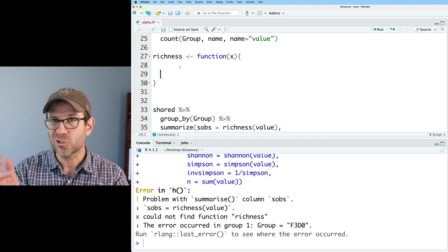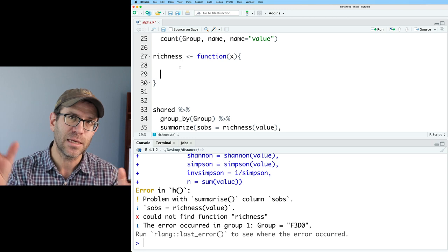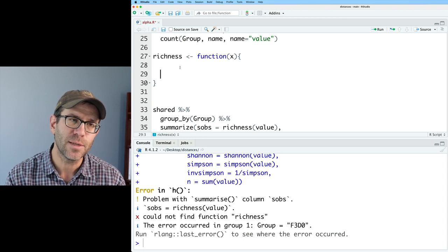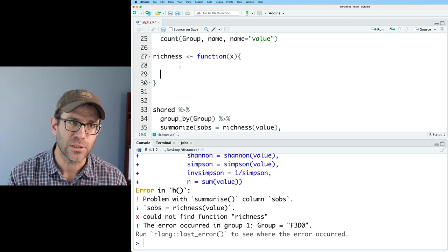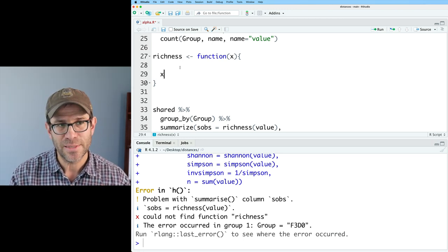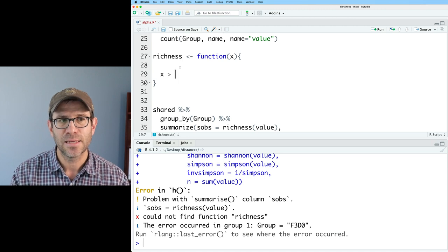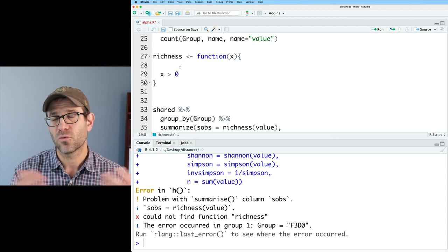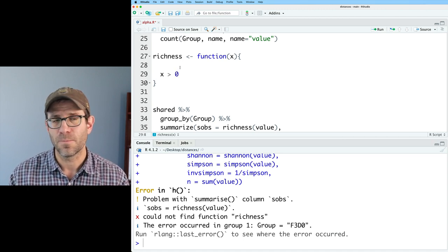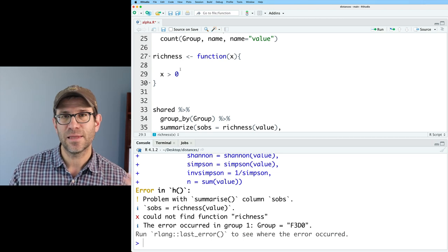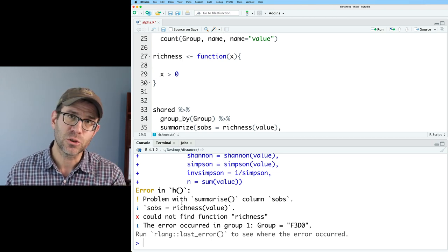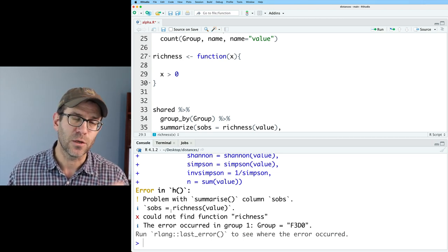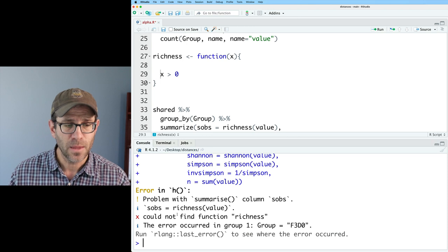And then the special sauce, as I like to call it, is what happens in between these curly braces to calculate the richness. And so the richness is going to be determined by taking x and all those values of x greater than zero. By if I take things greater than zero, I'm going to get true or false values if x is greater than zero.